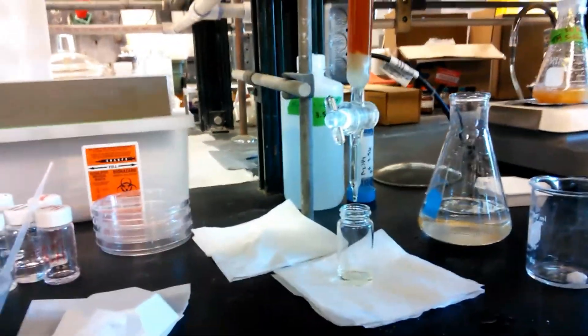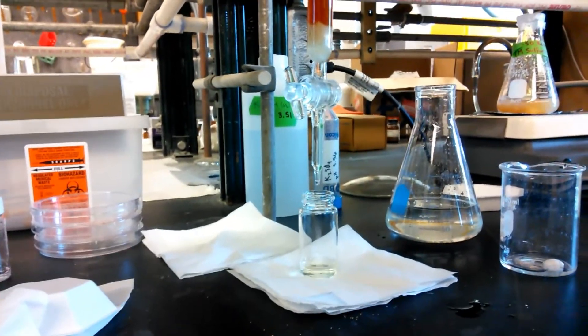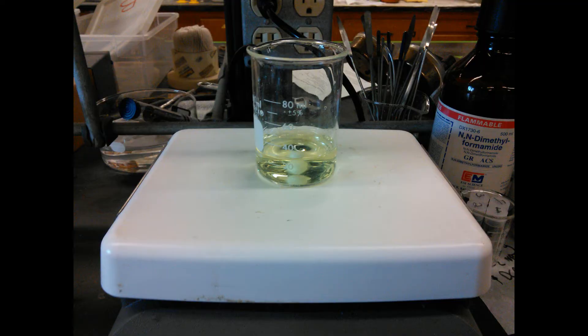The tungstate solution is slowly passed through the column and the bright yellow product is collected. Water is added to the bright yellow transparent solution and this is stirred overnight.